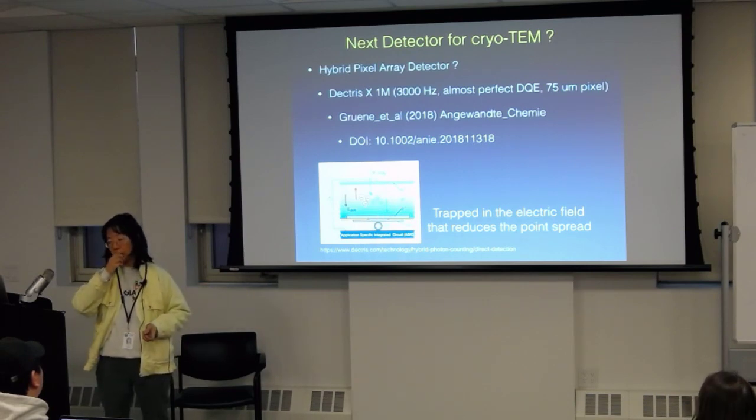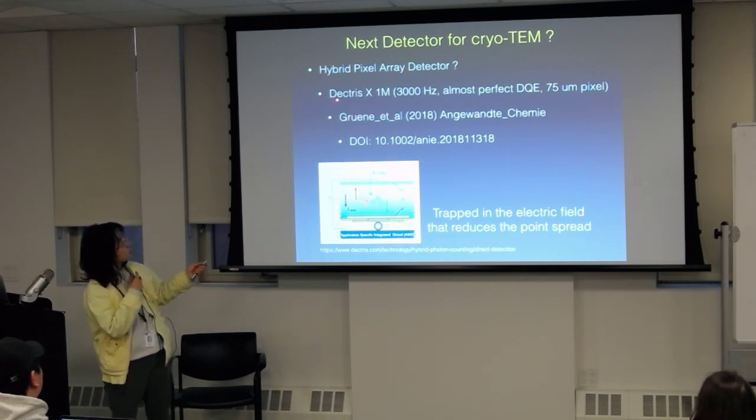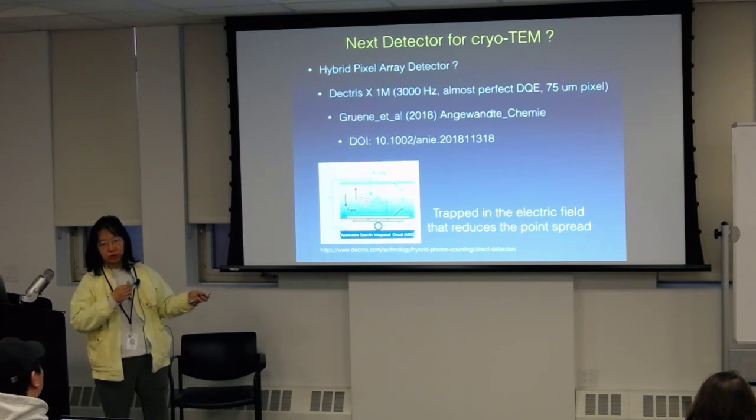Now, the problem is why we are not using it. The other thing is that, for example, this is one of the detectors featured in this particular paper that talks about electron diffraction on chemicals.